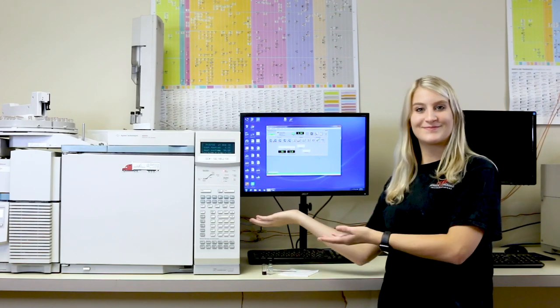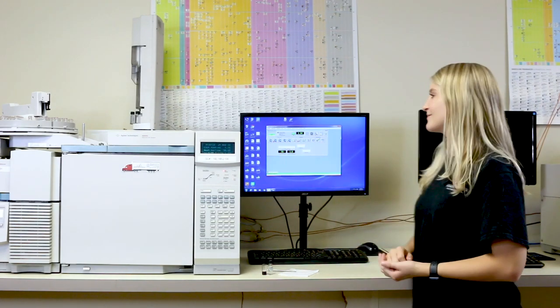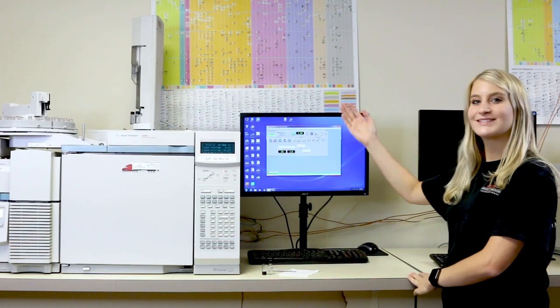This is a GC and mass spec machine we use for shooting the oil on, and it's a company program we use for the process.